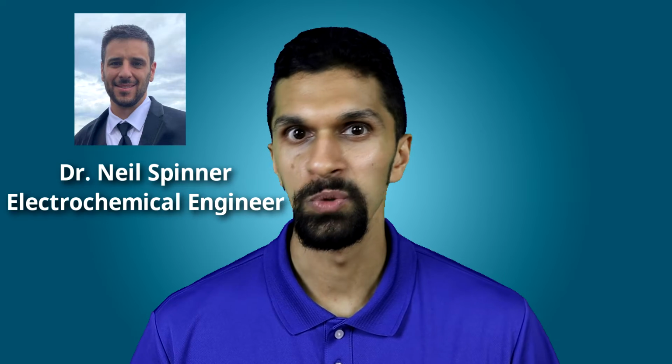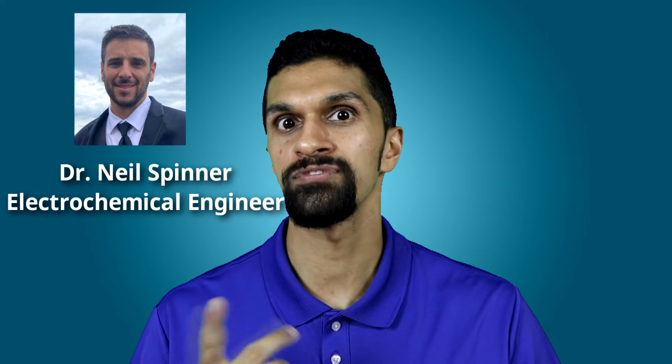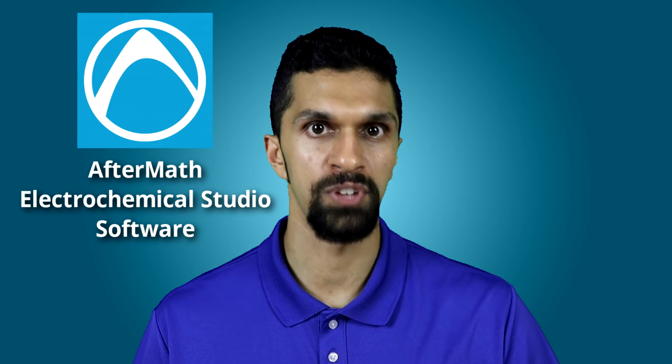Hey folks, in this video my colleague Dr. Neil Spinner will be giving a crash course or video tutorial on our AfterMath Electrochemical Studio software.